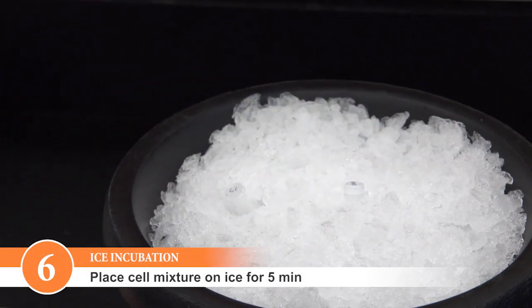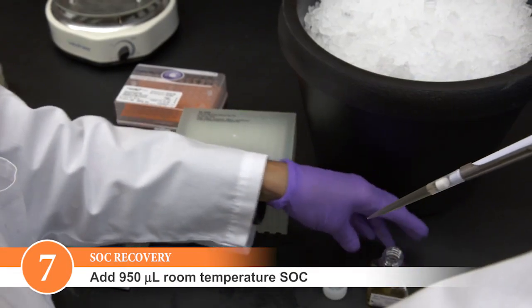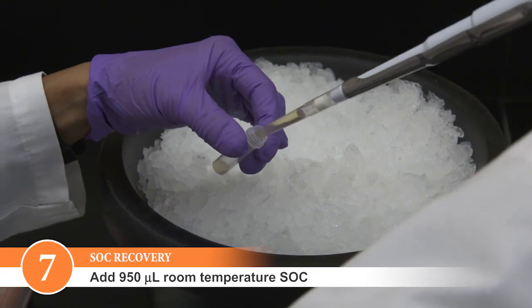Incubate on ice for 5 minutes. Add 950 microliters of room temperature SOC media to the transformation mixture.